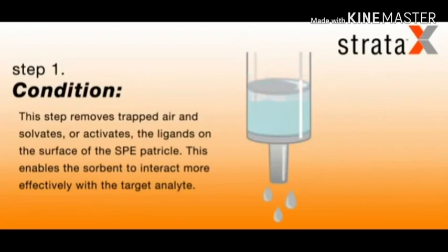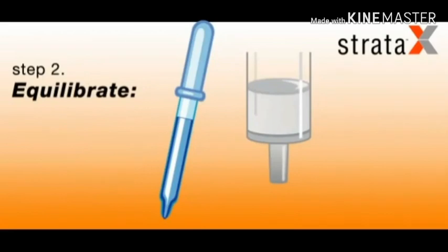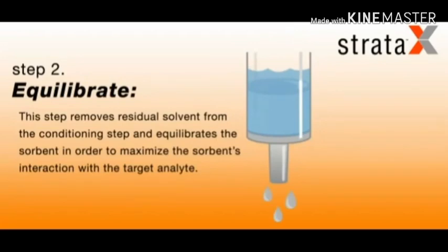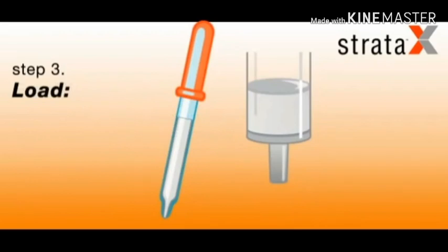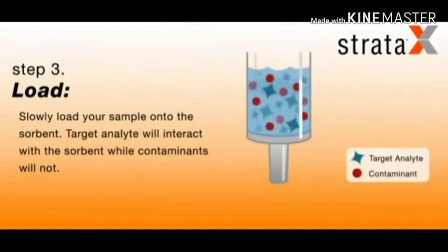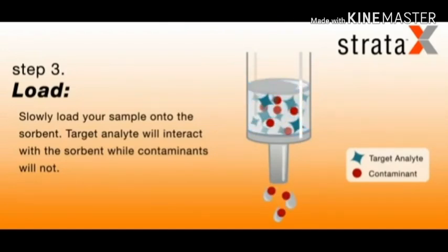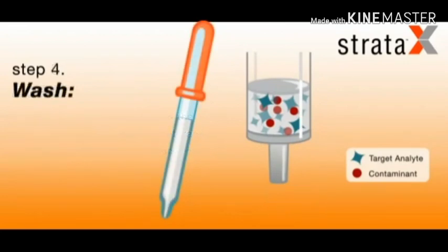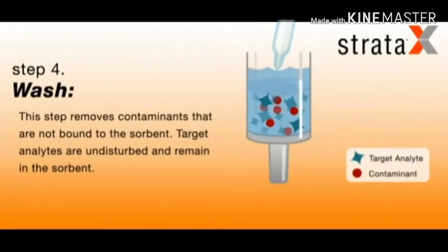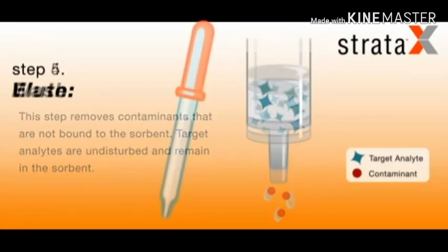First one is condition. The second one is equilibrate. The third one is load the sample. The fourth step is wash. And the final step is elute.